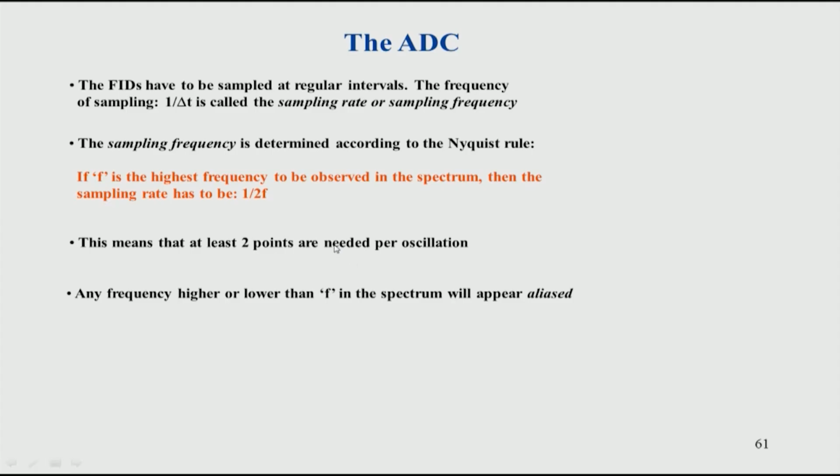So this brings us to the end of the hardware. This was a very brief overview of what NMR hardware looks like. There are many more details one can go into, but as far as practical aspects are concerned, we have looked at the main components. Now we will move on to the interpretation. In the next class we will look at how a simple 1D experiment spectrum looks, and we will start looking at the different signatures in a 1D.